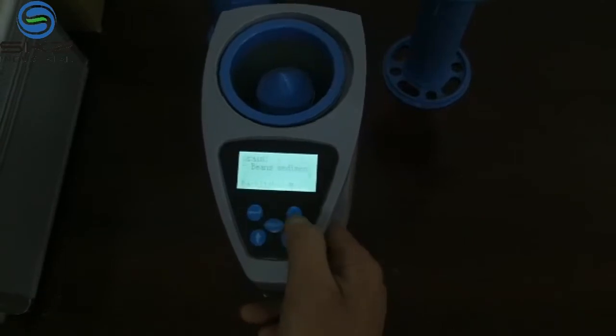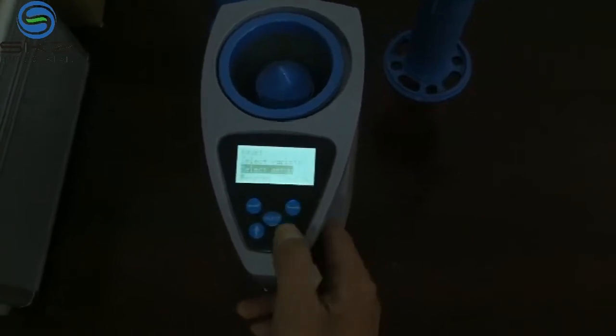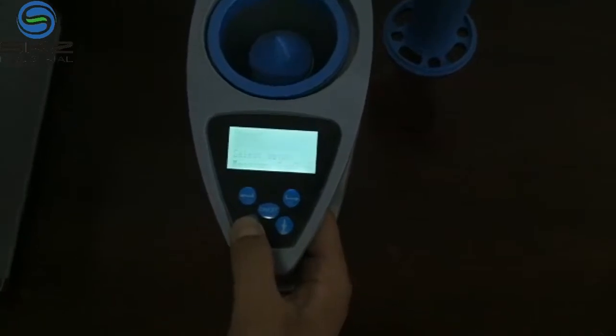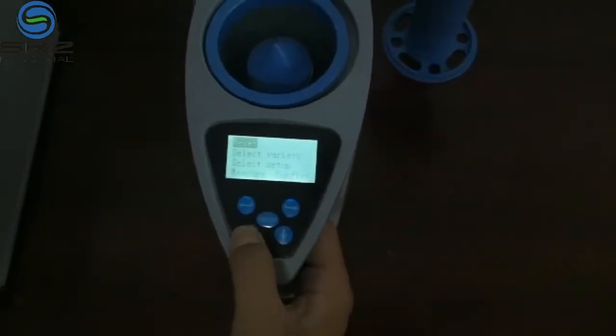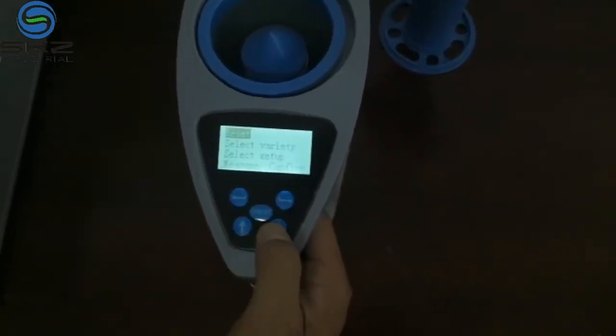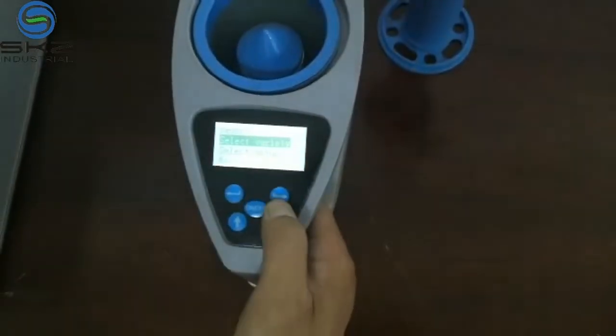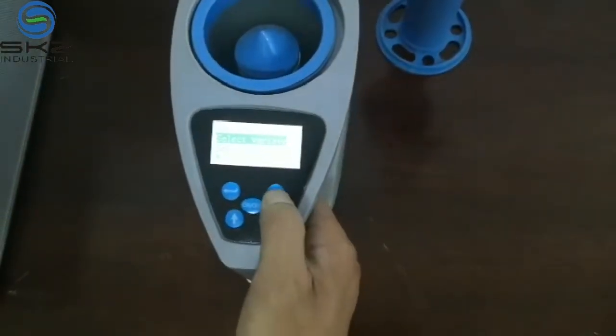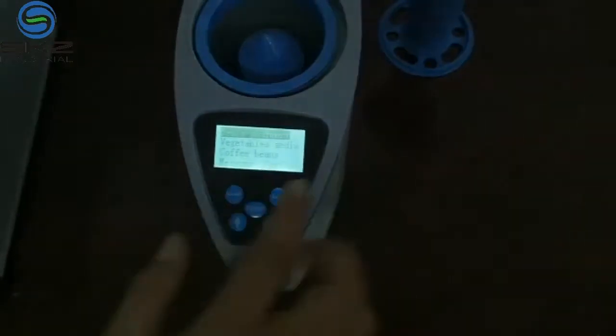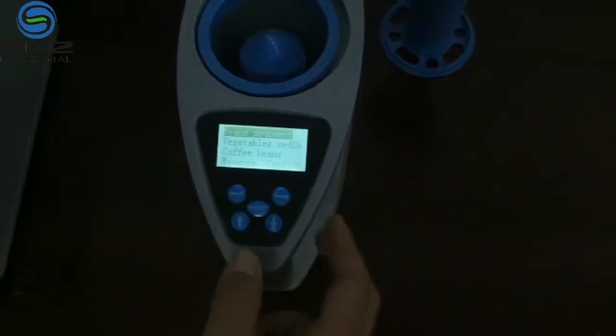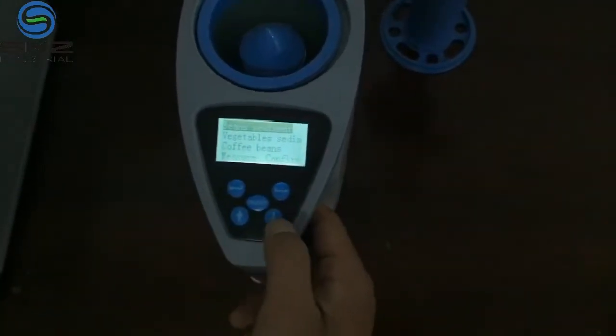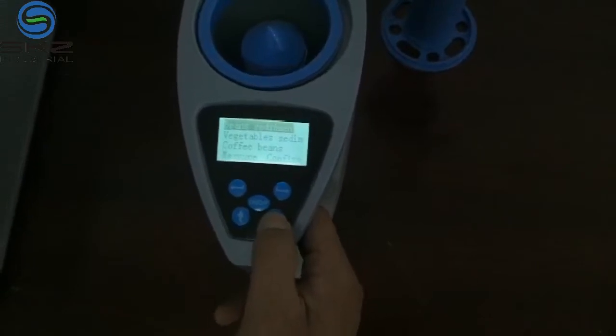First press menu, then select variety. There are 33 materials total. Now we select coffee bean.